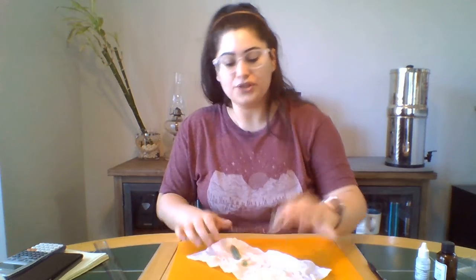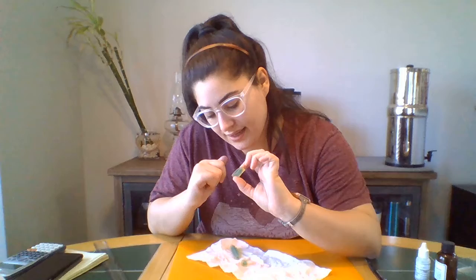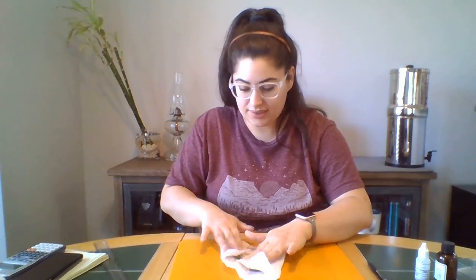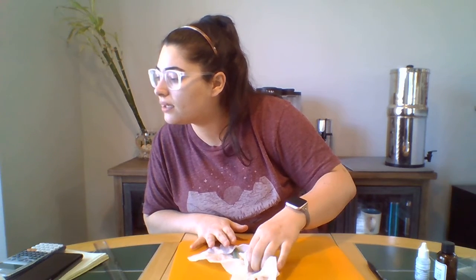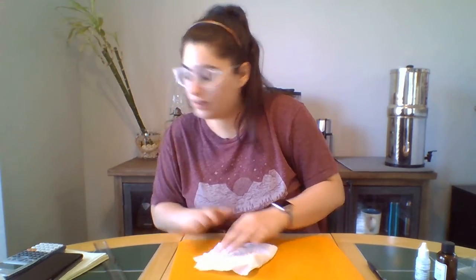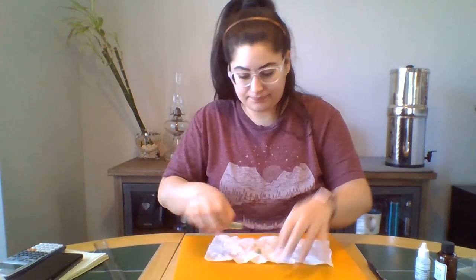Ooh, so on the outside it looks like the paper towel has made some kind of indentions. It's like rubbing off, so it's able to make a pattern because of the surface of the paper towel. But when I cut into it, it'll probably be clearer. Yeah. All right. It's probably sufficiently dry.